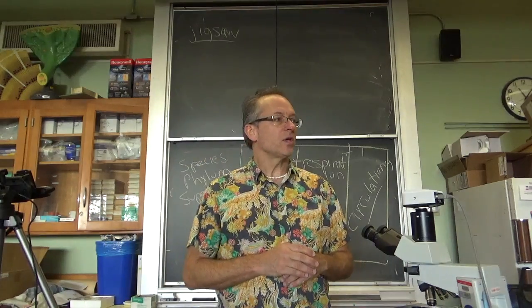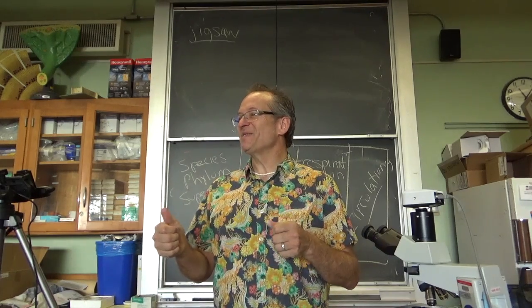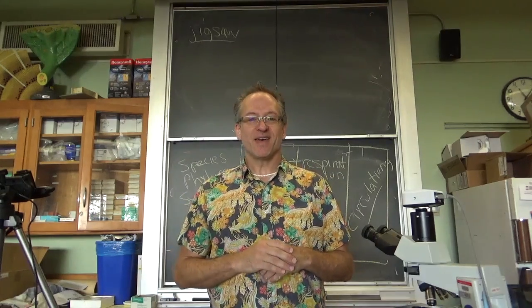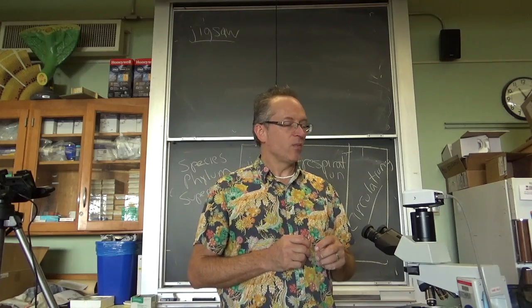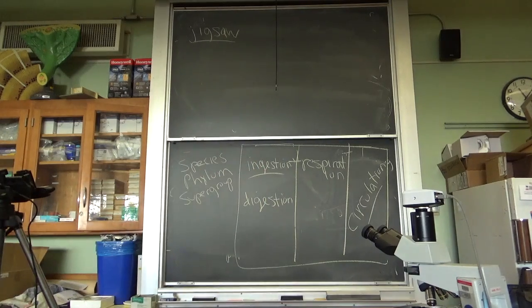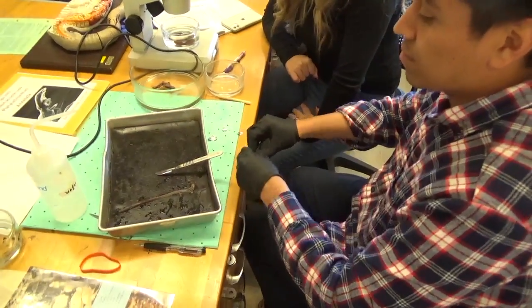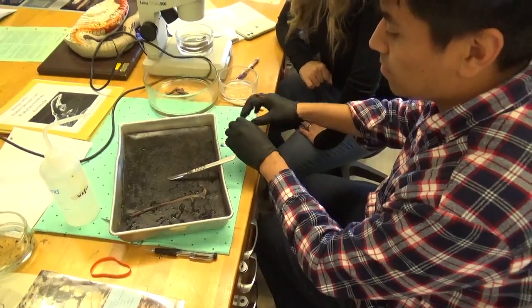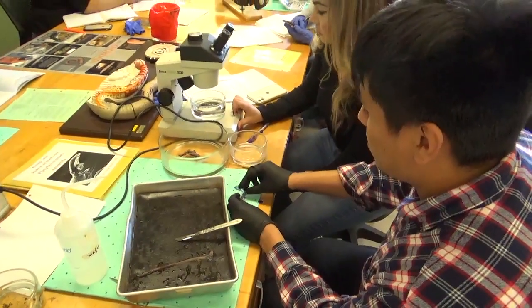Okay, so. Feeling ready? No. So you've got animals there that definitely won't jump at you. They don't have any teeth. Okay. So call me over if you need some help, and we'll get started. In fact, I think the earthworm, you can look at the blood vessel under the microscope. So we'll see if we can see the peristaltic contractions of the blood vessel.